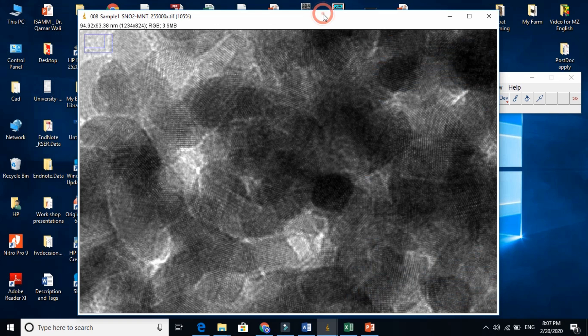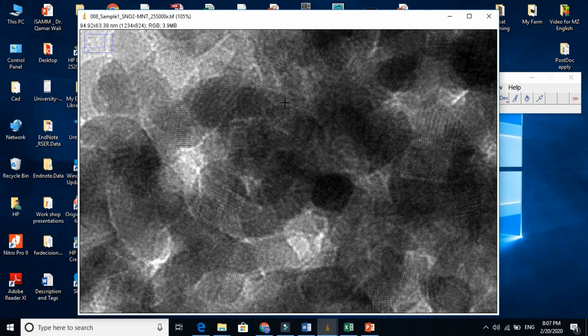Now the task is very clear here. There are so many ways to find. For example, this is now the grain, so I need to click here.